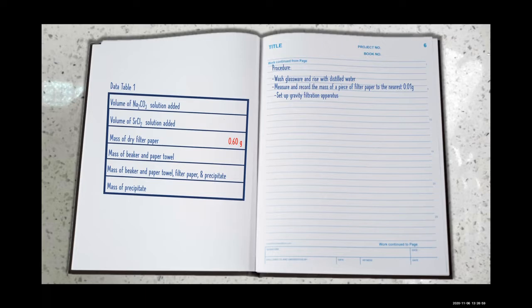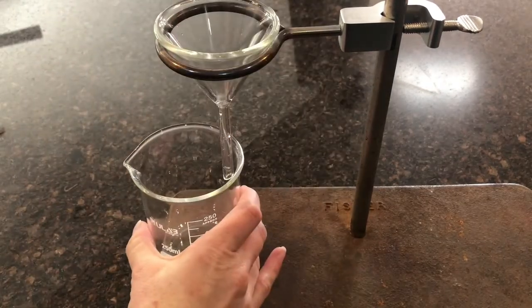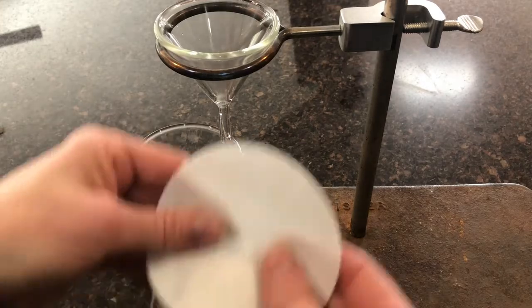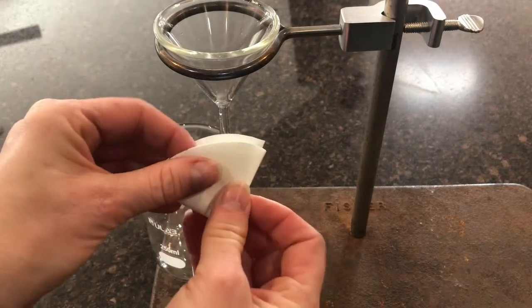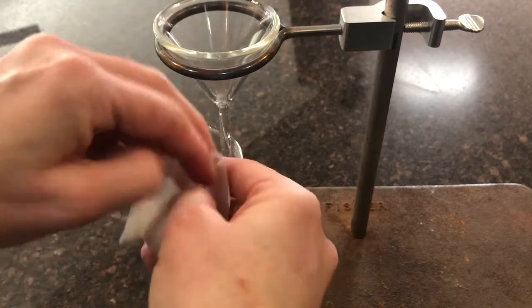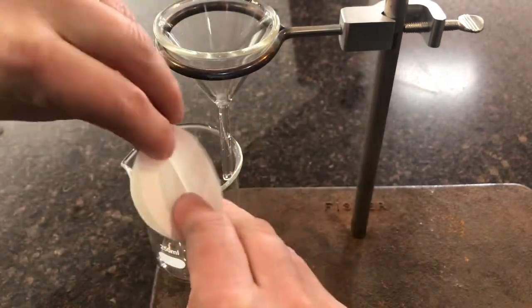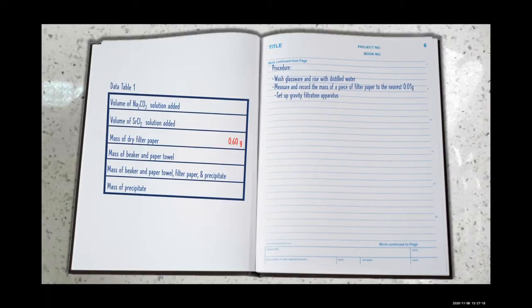Then we will set up our gravity filtration apparatus. We will label a paper towel and place it in a clean, dry 250 milliliter beaker.